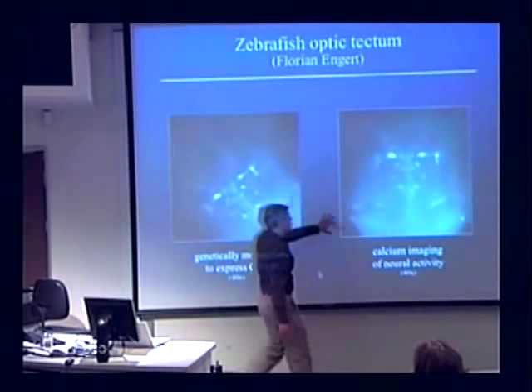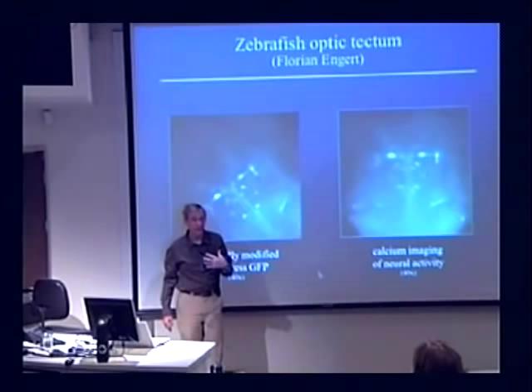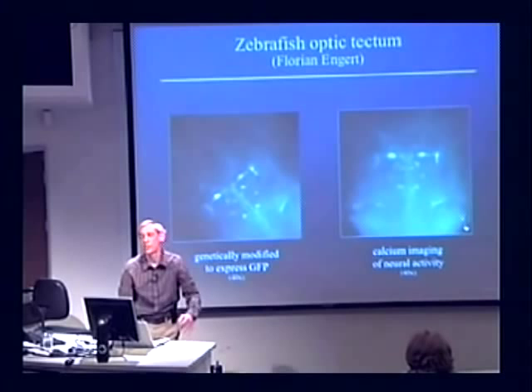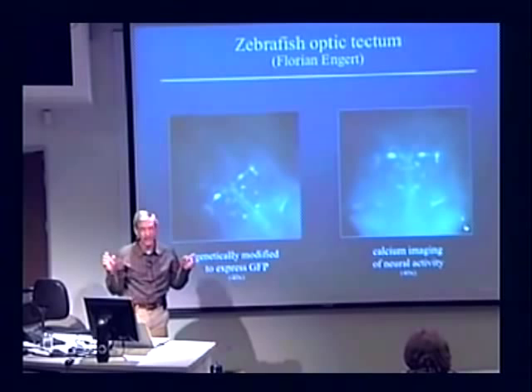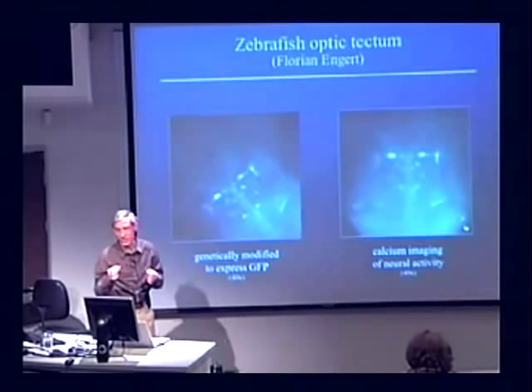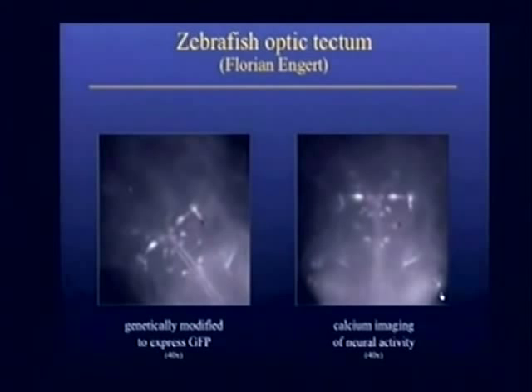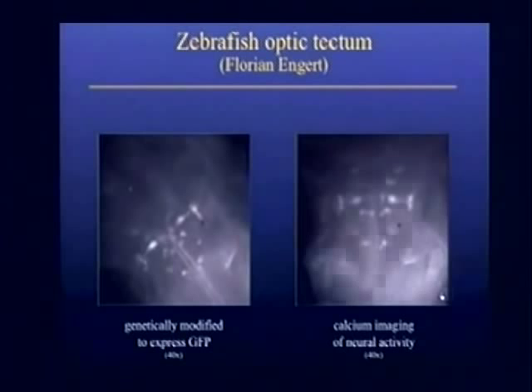What we're going to do over here is what's called calcium imaging. As a neuron fires, it uptakes calcium, which causes fluorescence. In proportion to its amount of firing, it becomes brighter in this micrograph. What we're doing here is, in real time, stimulating the zebrafish, meaning shocking it. It's immobilized; it's stuck in jello, or agarose, as it's called. You'll see those two escape neurons fire, and then the tail flicks, which you can't see here because we're just looking at the brain. Every time you see those flash, we're shocking the fish. And it's three-dimensional, so you can see us rotating it around there.